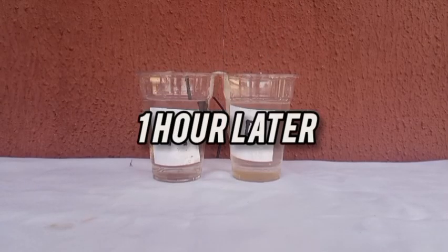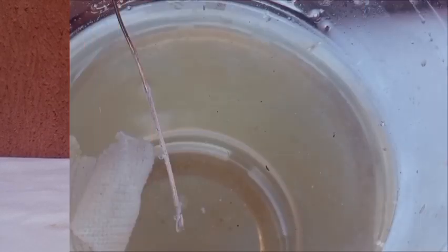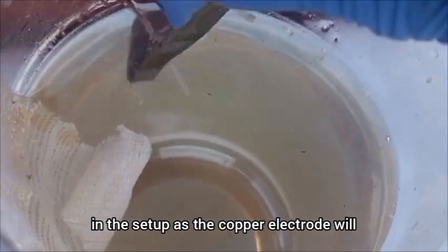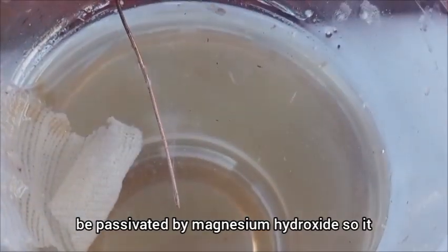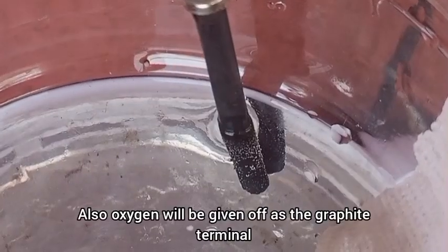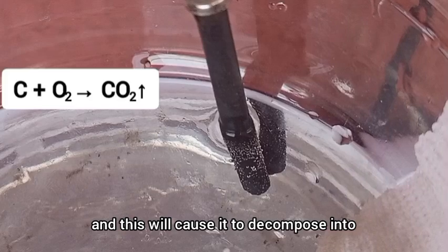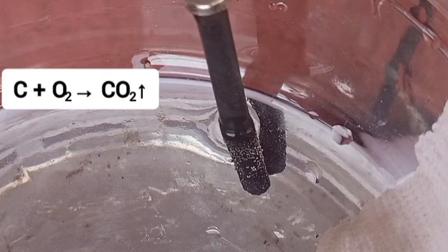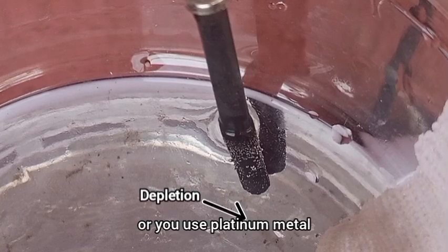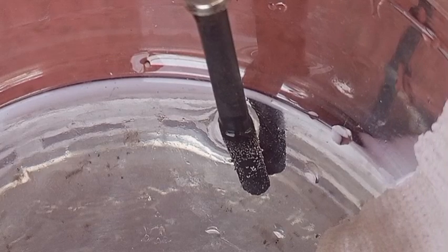While this method is extremely easy, it has its limitations. First, you have to continuously maintain the setup as the copper electrode will be passivated by magnesium hydroxide, so it has to be cleaned continuously for the reaction to continue. Also, oxygen given off at the graphite terminal will cause it to decompose into a gas, depleting your electrode — so you either use a lead dioxide electrode, which isn't entirely safe, or platinum metal.